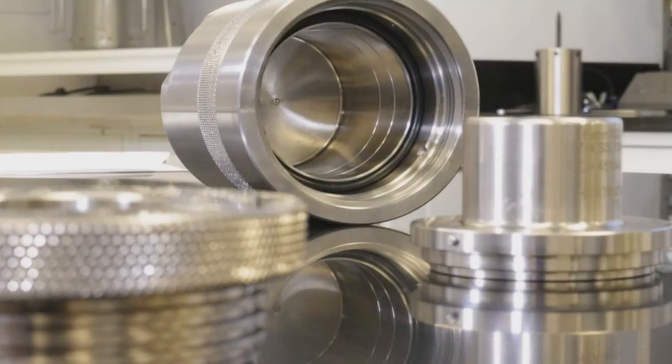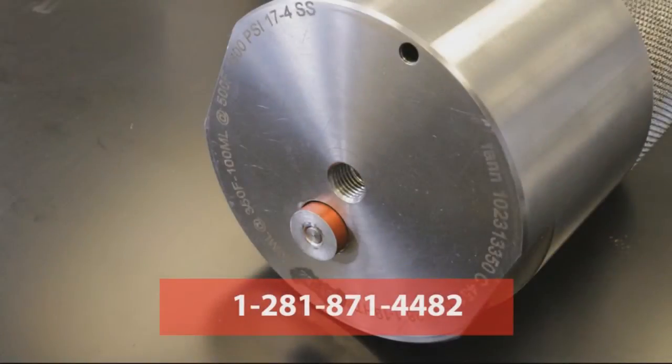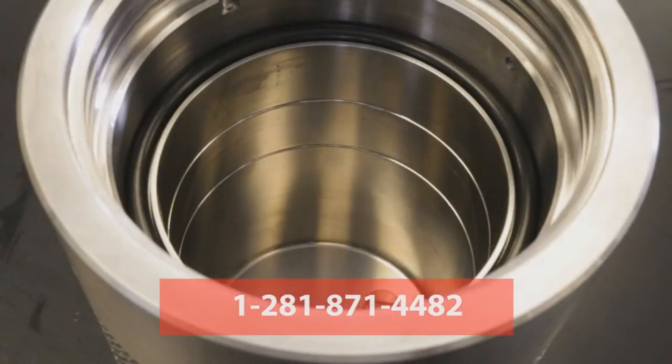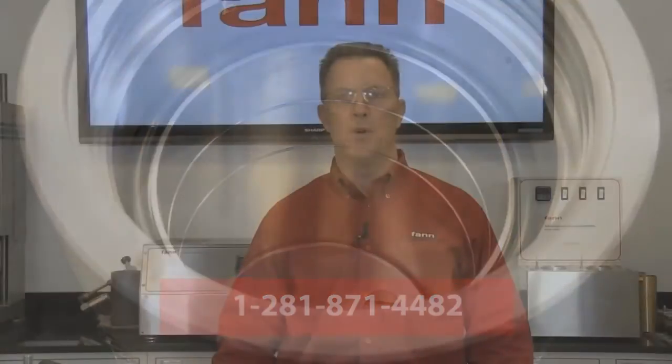Fan Instrument Company is proud to offer the high-pressure, high-temperature Safe Cell. Contact your local Fan authorized distributor or contact us at this number and we'll put you in touch with one.